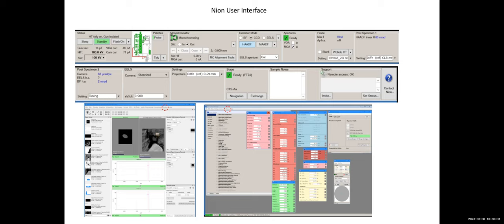So for example, you're done with sample 2, you move to sample 3, but you save the location on sample 2, and when you're done with sample 3, you go back to sample 2, you can click go and go back to the same location. There is some hysteresis, which means when we switch the holder and move back, the real value will be different. For example, if you were exactly on zone axis and you do something, move a lot or go to another holder, and you come back and load the saved position and tilt, you will say, okay, it's not exactly on zone anymore. It's off by 2 degrees. Yeah, you should expect that. Yeah, that's the mechanical problem.